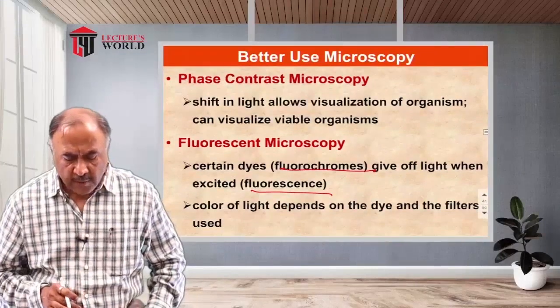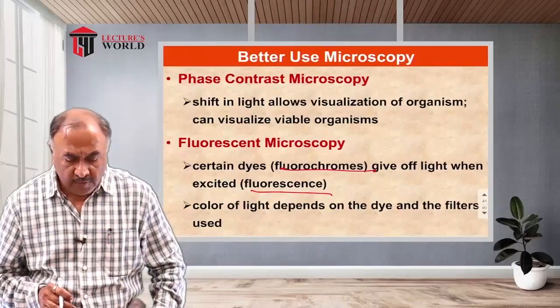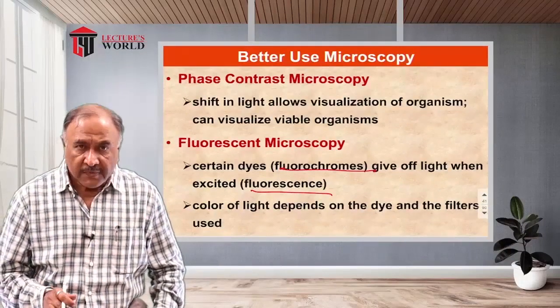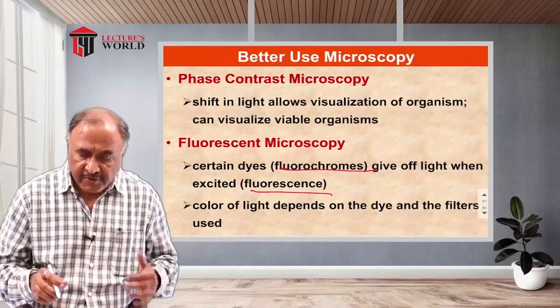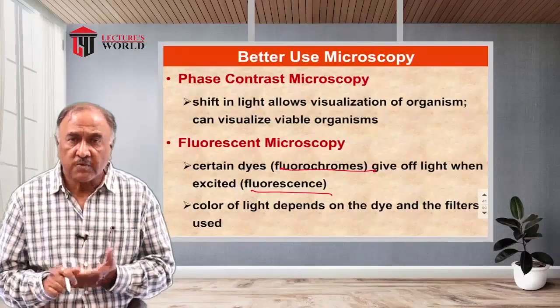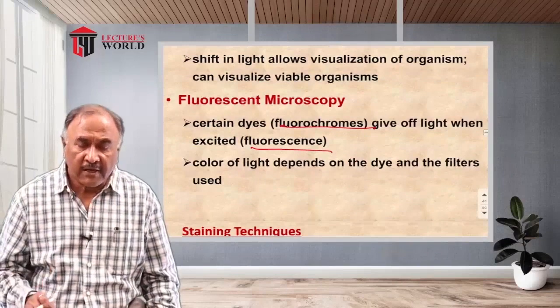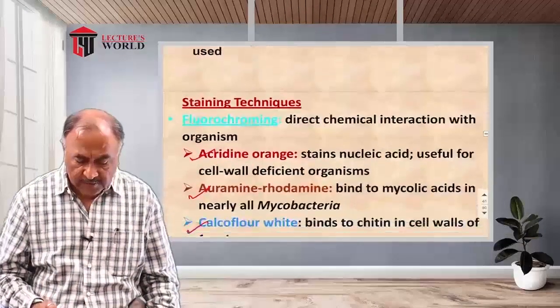Then we also have, apart from fluorescent microscopy, phase contrast microscopy. This shift in light allows the visualization of an organism, and we can easily see the microorganisms.